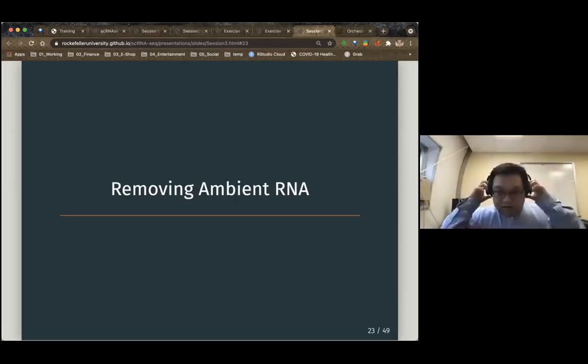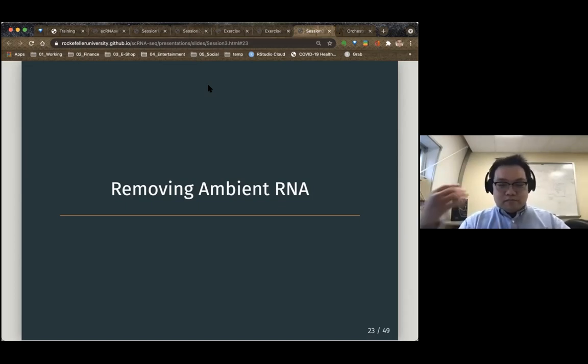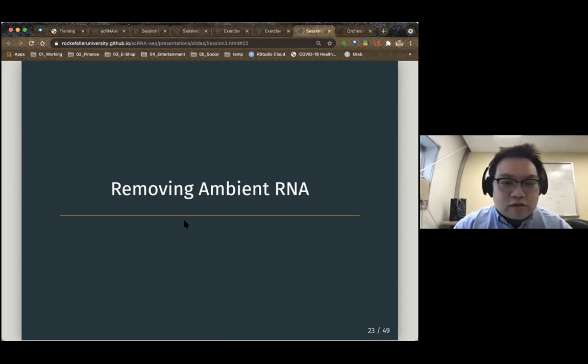Sorry, I'm back. So after the basic analysis, right now we will enter another section to demonstrate how to remove ambient RNA.